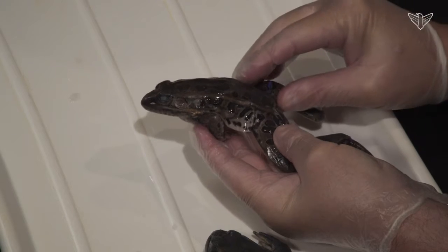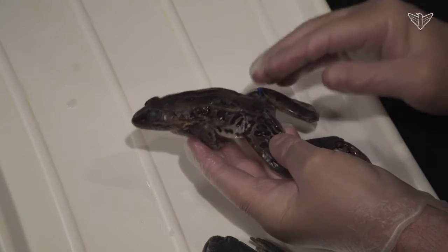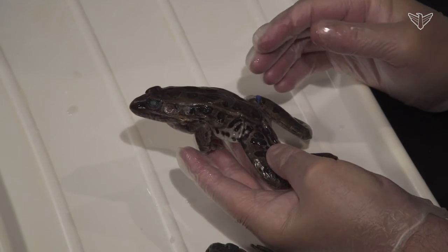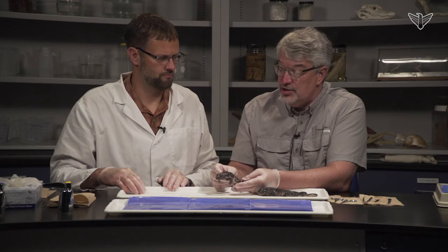We have two different ones here. Can you explain the difference between those two? Well, actually, I should first say that frogs are, as we did say, amphibians, and so they have a smooth, scaleless skin, and the skin is actually moist because they use it as a respiratory surface. So frogs, unlike most other tetrapods, four-limbed animals, actually use their skin for one of the major sources of oxygen, as well as, we'll see later on, lungs.